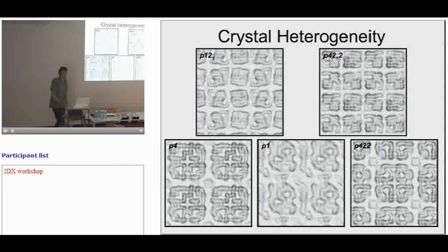No, 3D nanocrystals, because unless you have a very defined thickness, it's impossible, because you don't know how many unit cells you have in Z. If you have 2, 3, 5, 7, your diffractions are going to be different. So your method has to combine with the image mode, combining both image and diffraction. Yes, so the general way to solve a structure is to collect phases from images and then amplitudes from diffraction patterns.